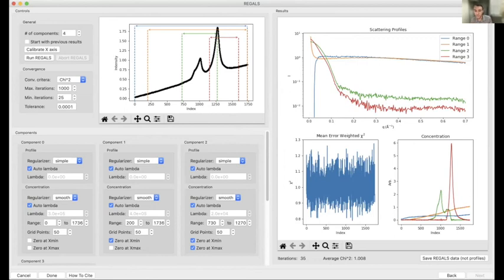So it's separating based on charge, and this particular column is sensitive to a single charge on the protein, so a difference of 1 electron. So anyway, it produces weird looking peaks sometimes, but the cool thing about this is we're able to get background subtracted SAXS profiles.